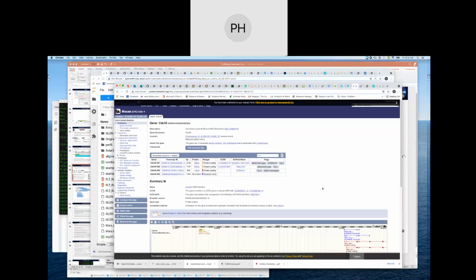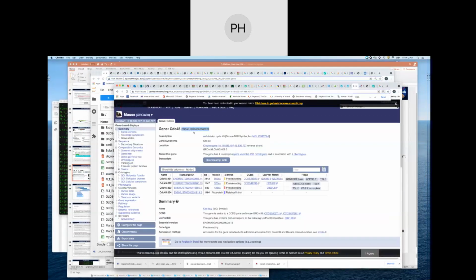Here it is. So I went ahead and I just looked up this gene, literally just Googled the Ensembl ID. And as you can see here, that's that gene that ends in 28, and then we see these 4 transcripts, the ones that end in 0028, 6990, 5585, and 1819.